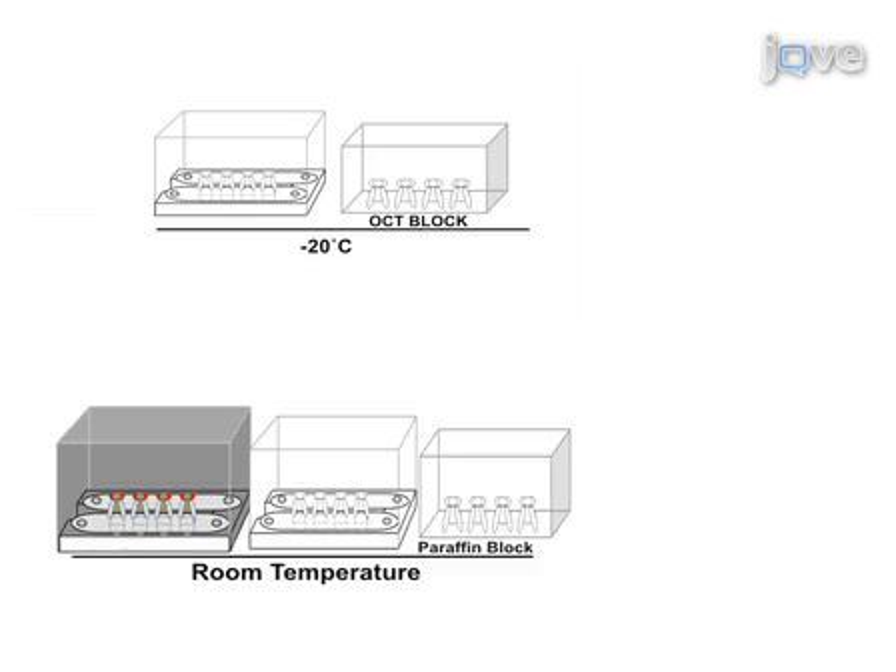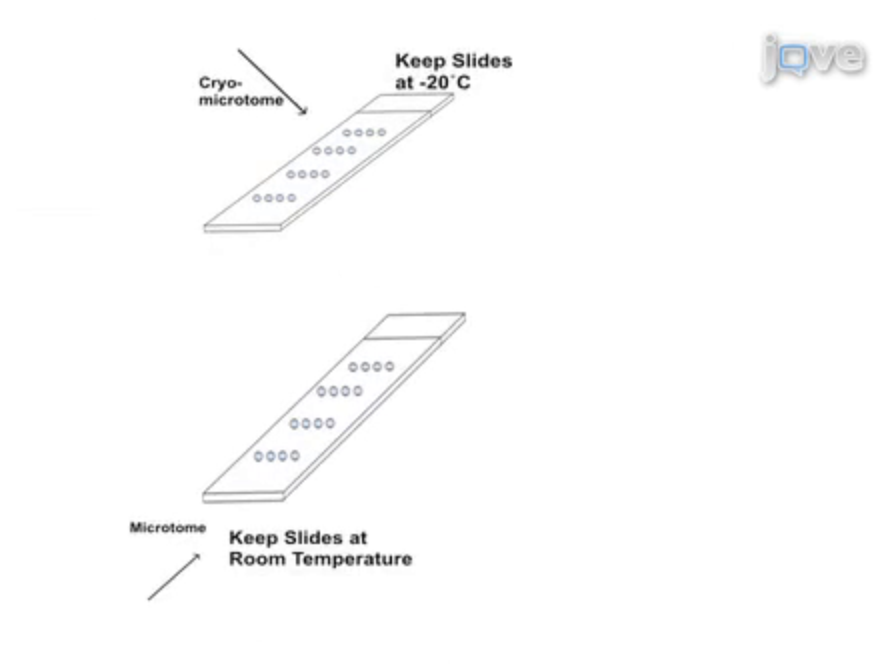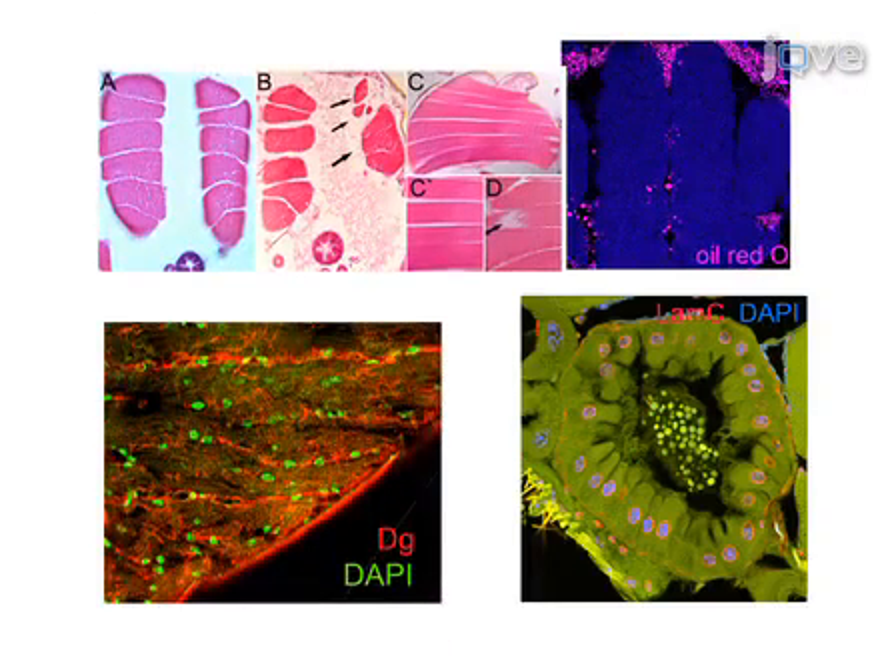The embedded Drosophila thoraxes are sectioned by microtome. Finally, sections are stained to visualize muscle tissue structures or detect different molecular components of the muscles. The resulting specimens, when used in conjunction with classical histological staining methods, fluorescent dyes, or immunostaining, reveal muscle tissue morphology and localization of muscle-specific components.